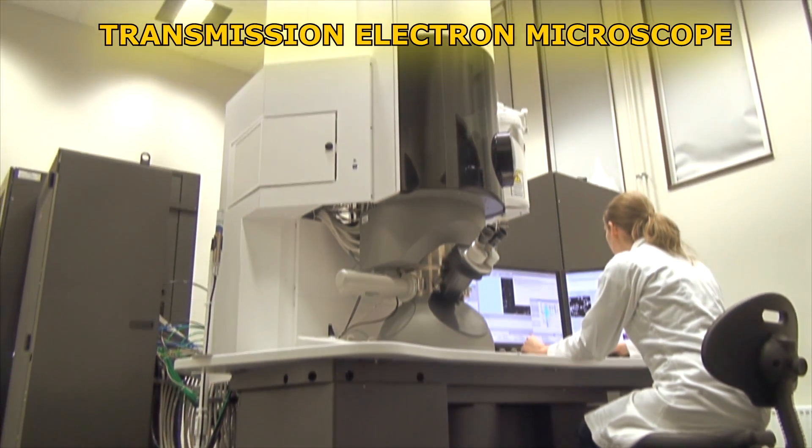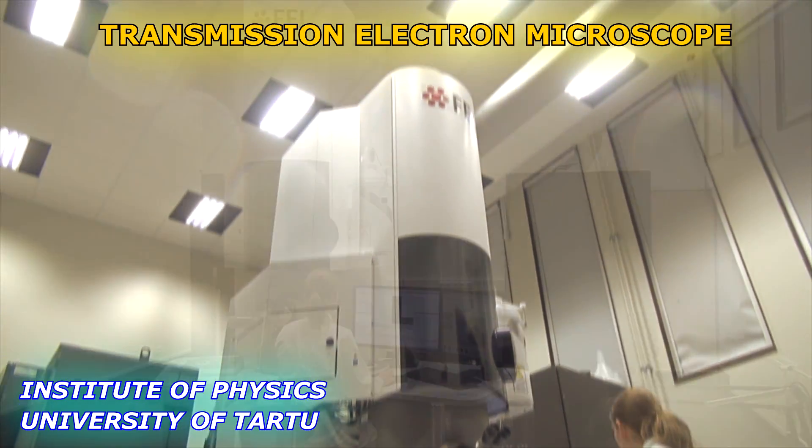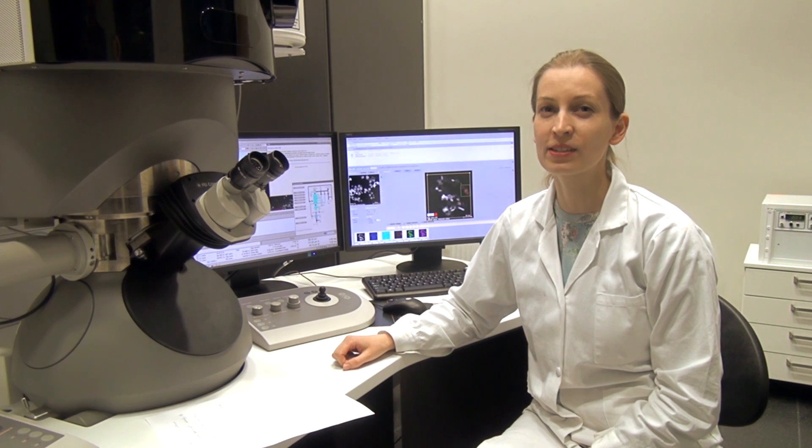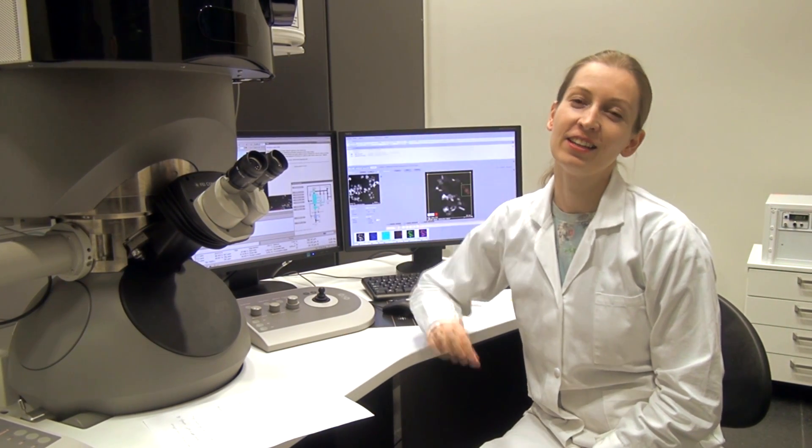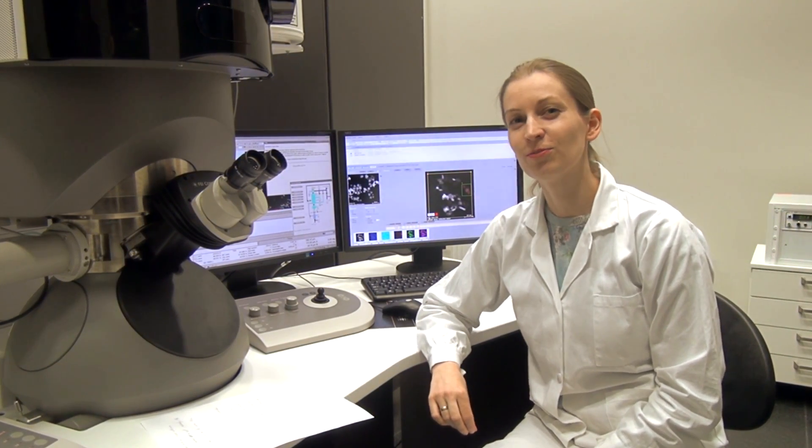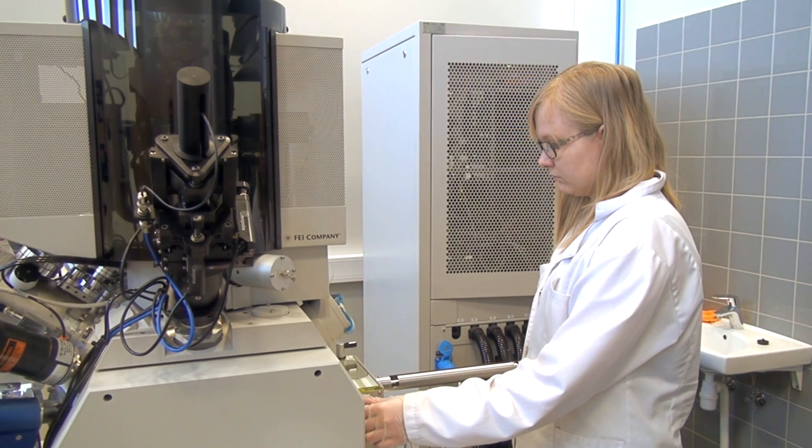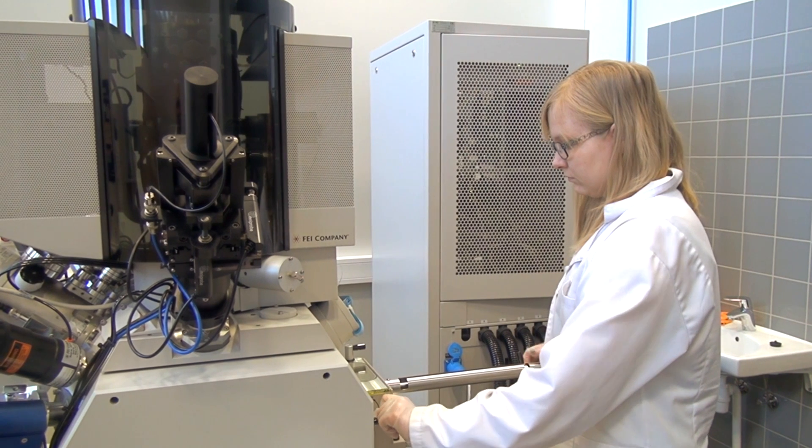Over here we have a modern transmission electron microscope, which is one of the most powerful tools a material scientist can use. This microscope can achieve even atomic resolution, but it comes with a price. The samples need to be very thin, 10 nanometers or so. Making a material so thin, however, is no simple task. But it can be done with the focused ion beam under a scanning electron microscope.